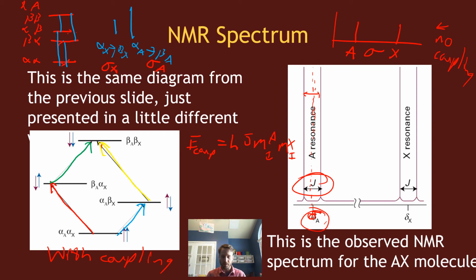So we can get some information about your molecule, and you get a lot of structural information as well as electronic information potentially from your molecule by studying these chemical shifts in the NMR spectrum.